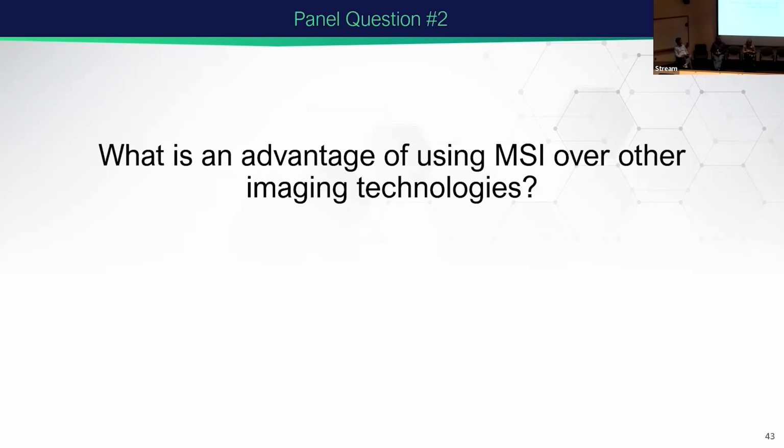And I think those fungal gardens that Lisa showed yesterday too, it's very hard to actually do immunohistochemistry on those because there's such a broad amount of tissue types, whether they're microbes and fungi, as well as the actual ant leaves that could be within this. So it's very hard to do targeted techniques when there are 17 different types of things within these complex samples.